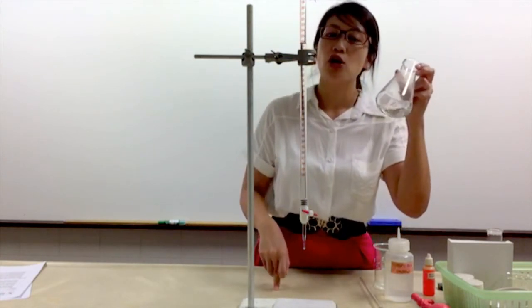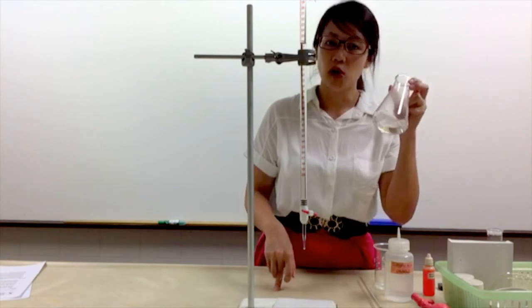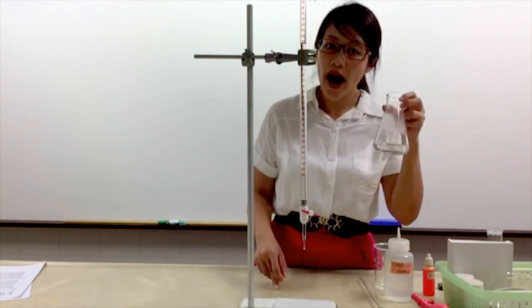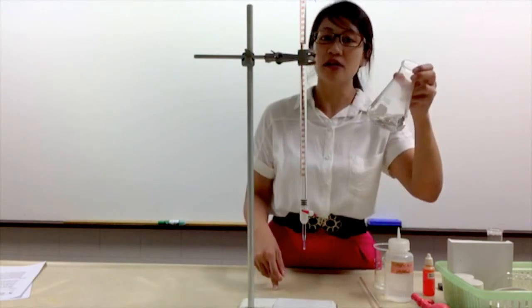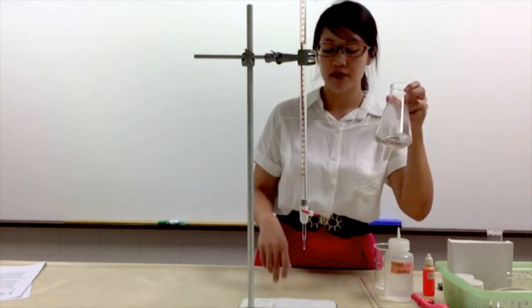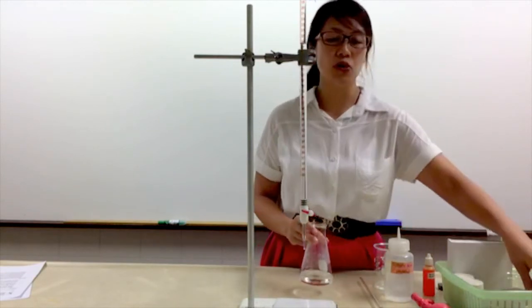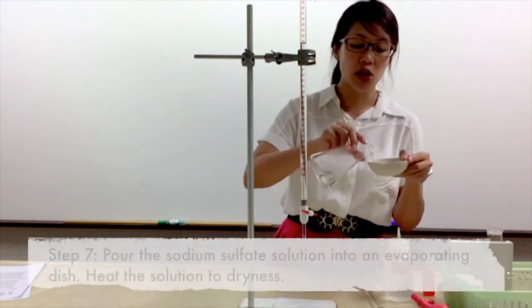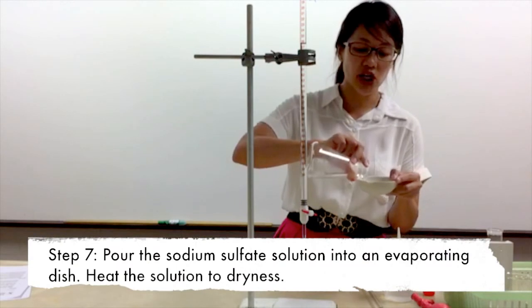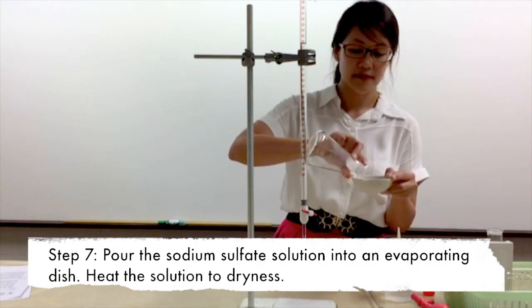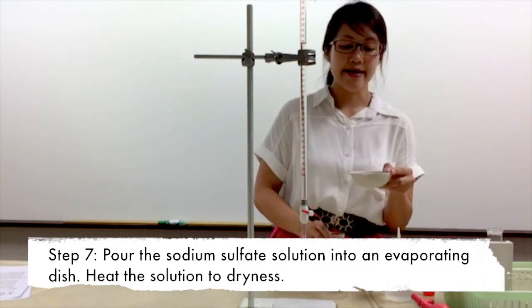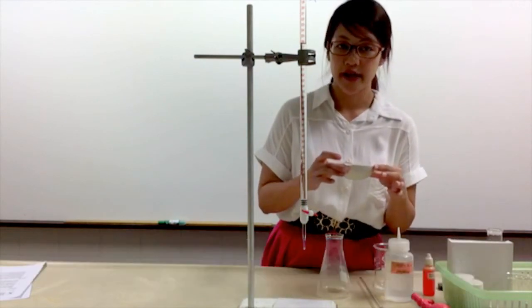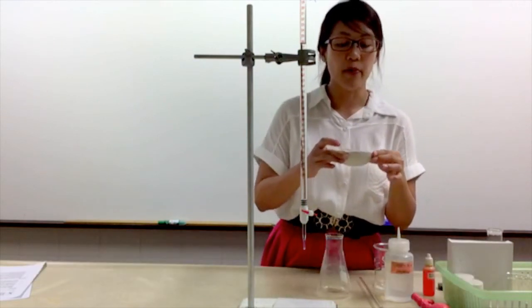Now look at this - this will now contain a pure sample of sodium sulfate solution. When you prepare salt, you will need to prepare the dry sample. So from the solution, how do you get the salt crystals? What we do is we will need to pour out the sodium sulfate solution into an evaporating dish.